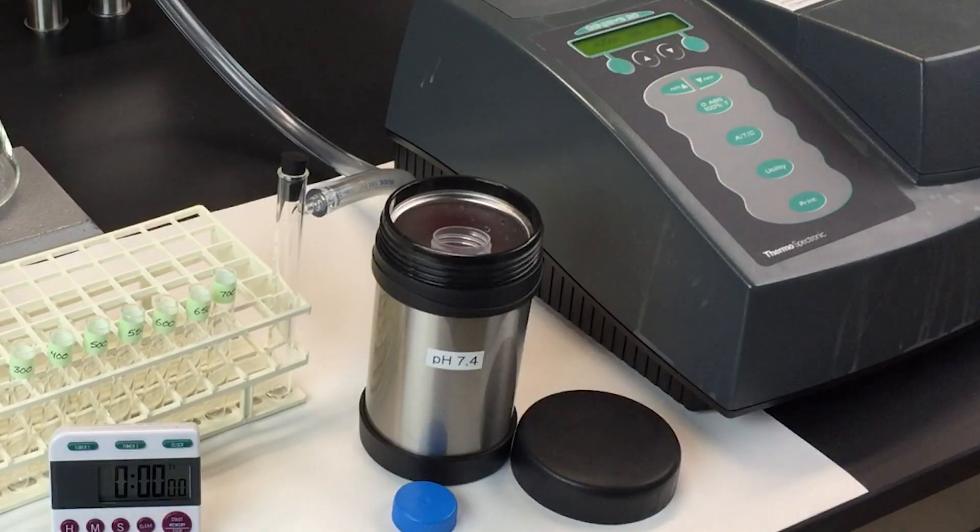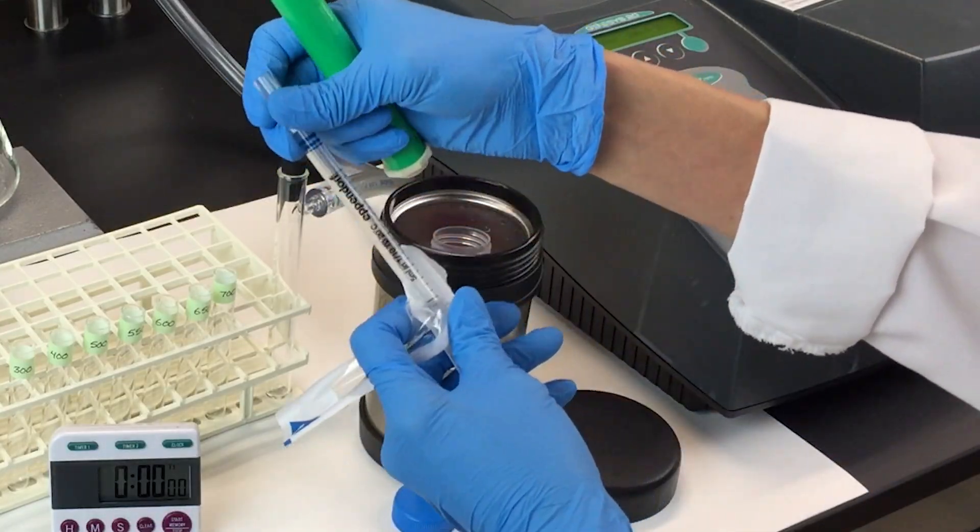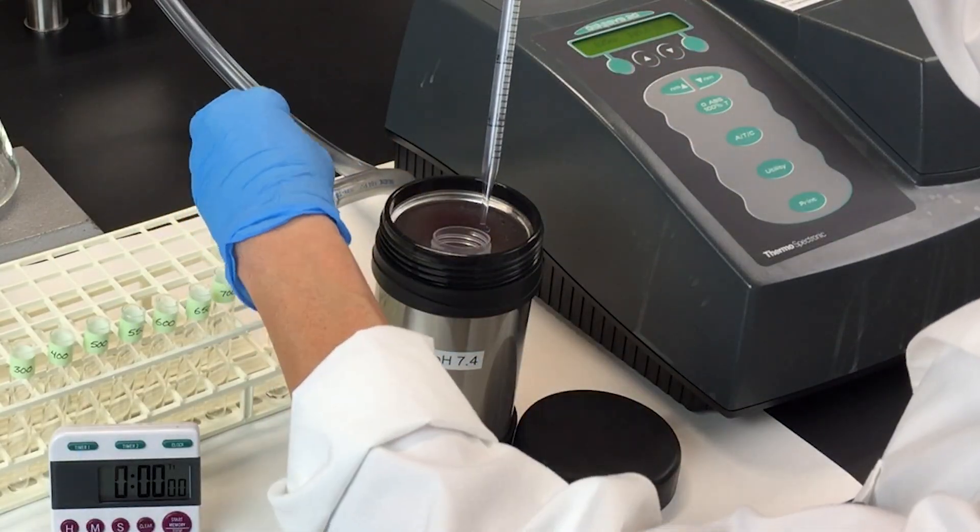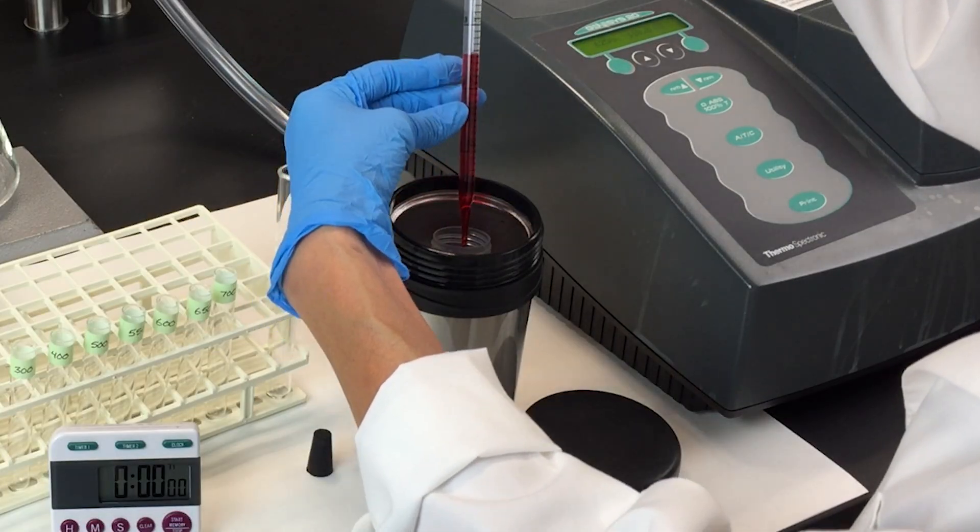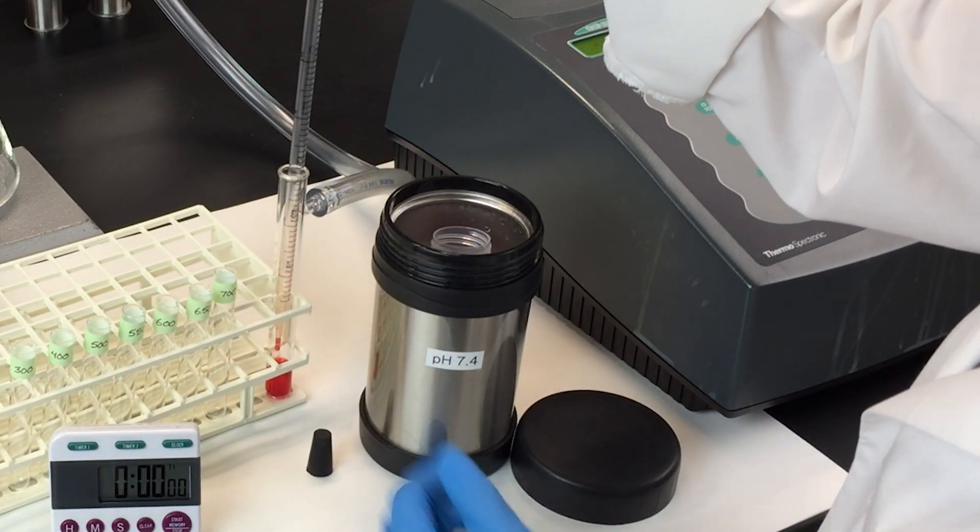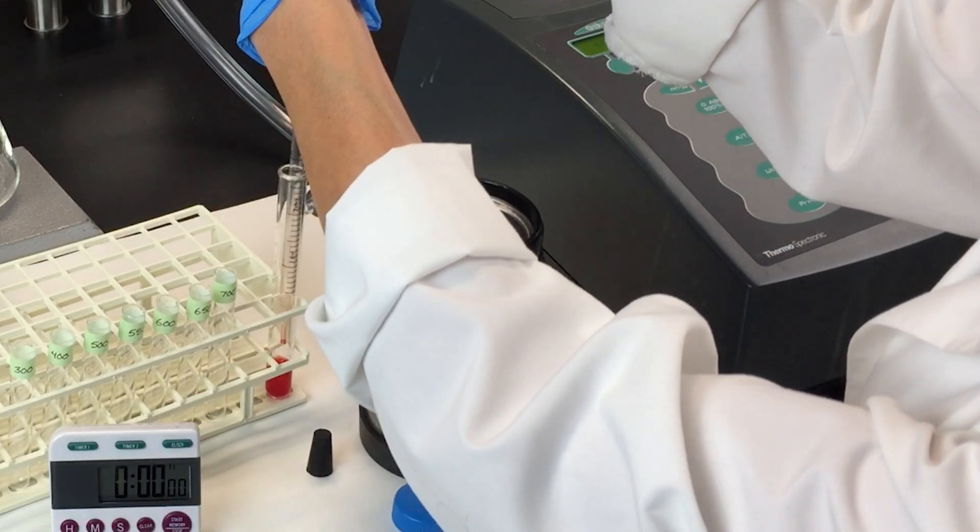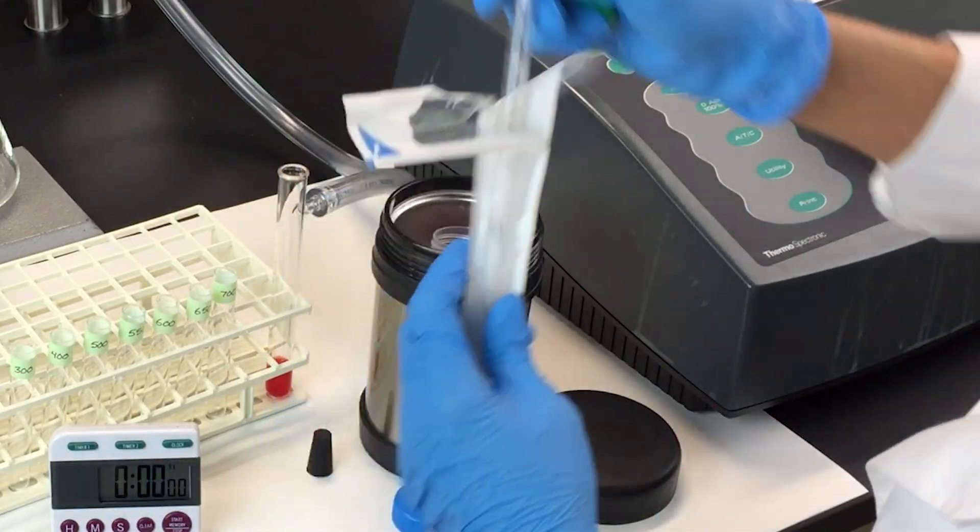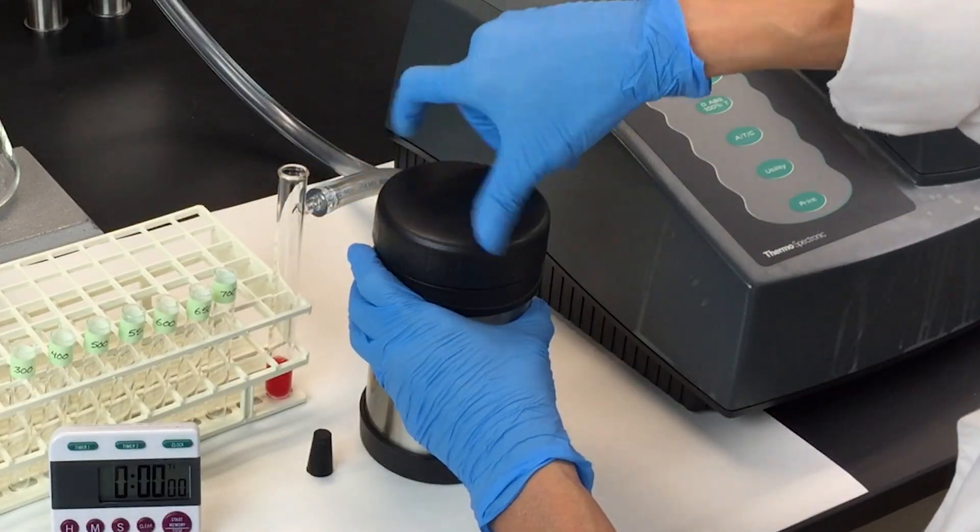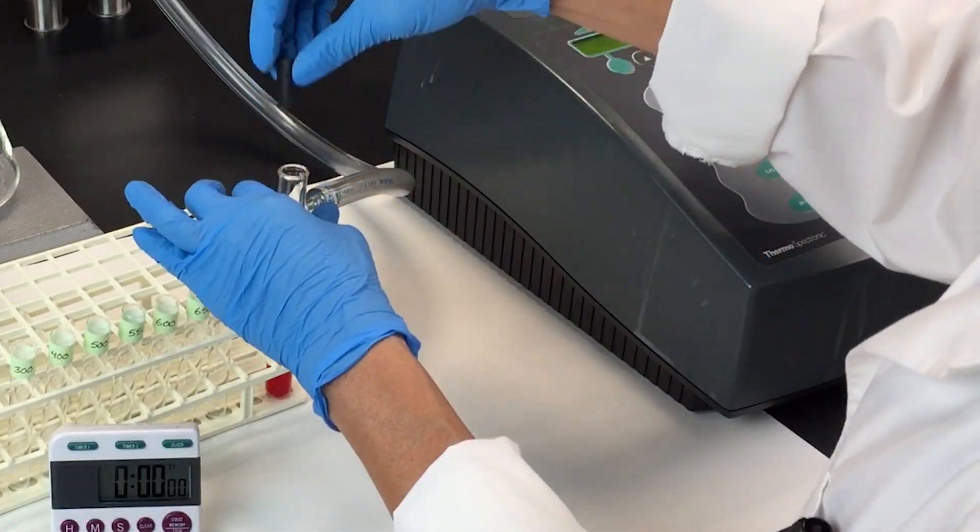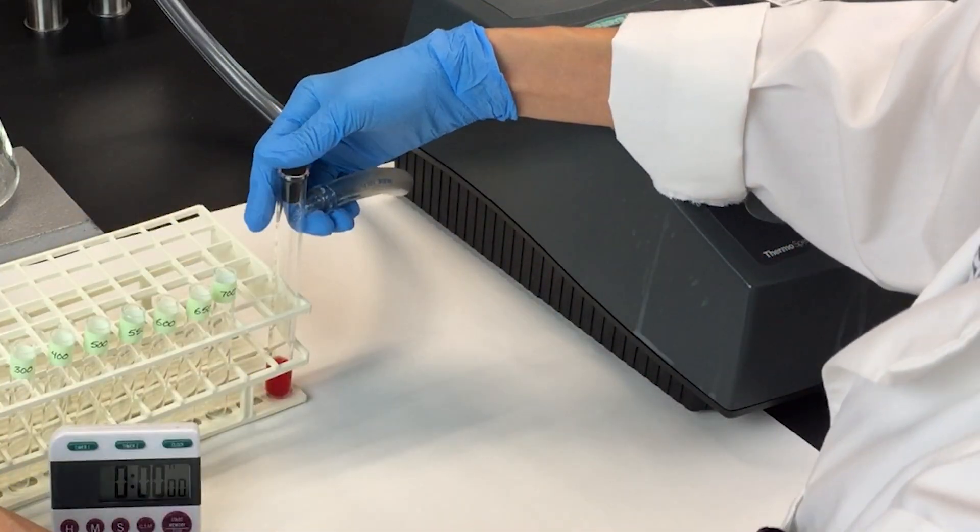Place 2.5 milliliters of hemolysate in the side arm tube that's attached to the vacuum system. Place the rubber stopper in the top of the tube to seal the system.